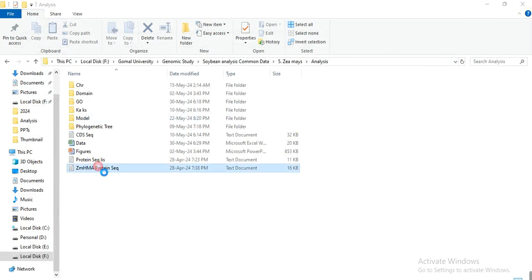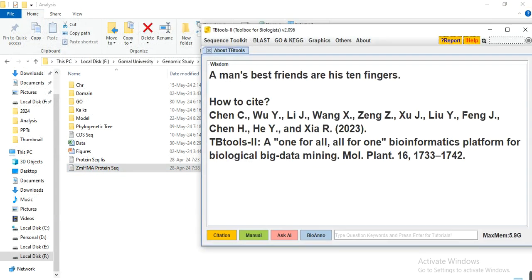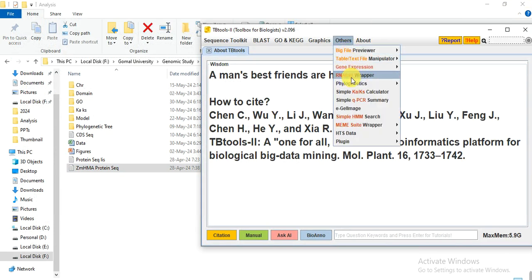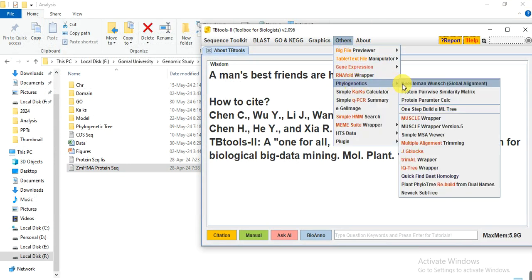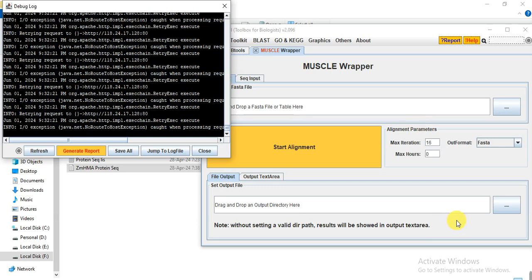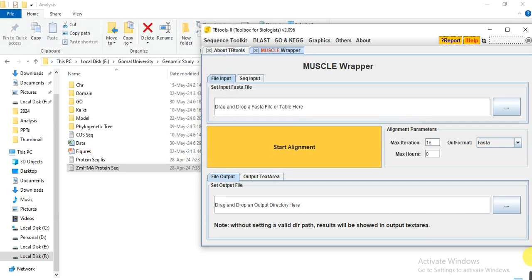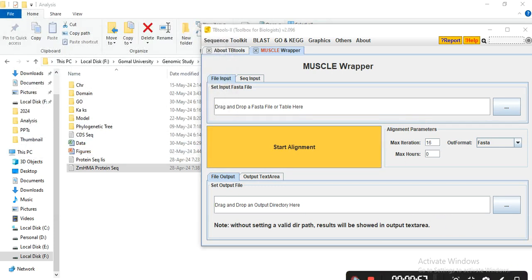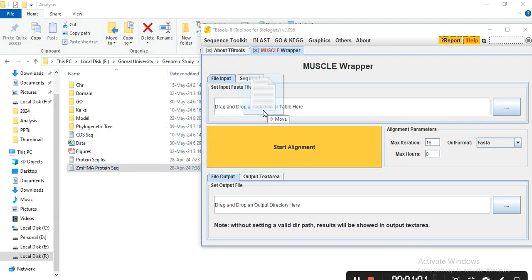First, you need to open the TB Tool, go to Others, Phylogenetic, and then MUSCLE Wrapper. Then drag this file that contains your sequences.